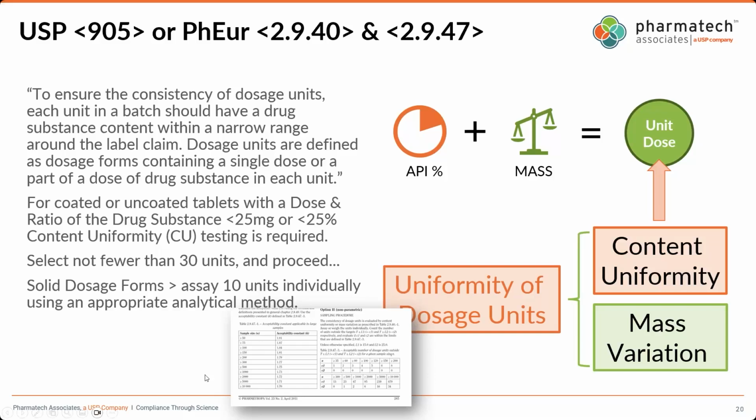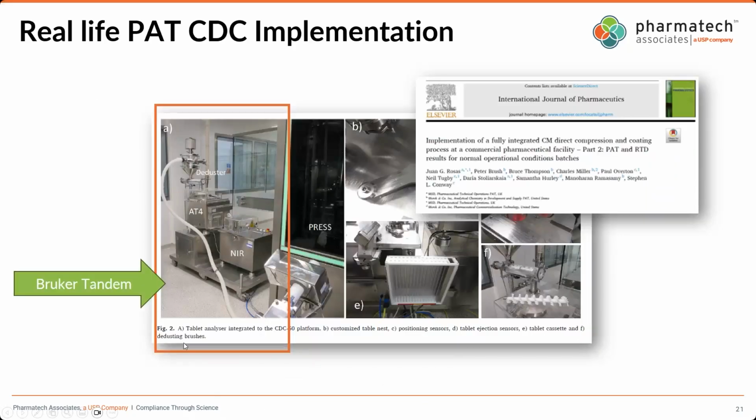No problem to mention that, because I think it was actually the European Pharmacopoeia who expanded the sample size in their description, for having capability for bigger batches on continuous. But let's go back to this point, because again, we wanted to highlight content uniformity testing.